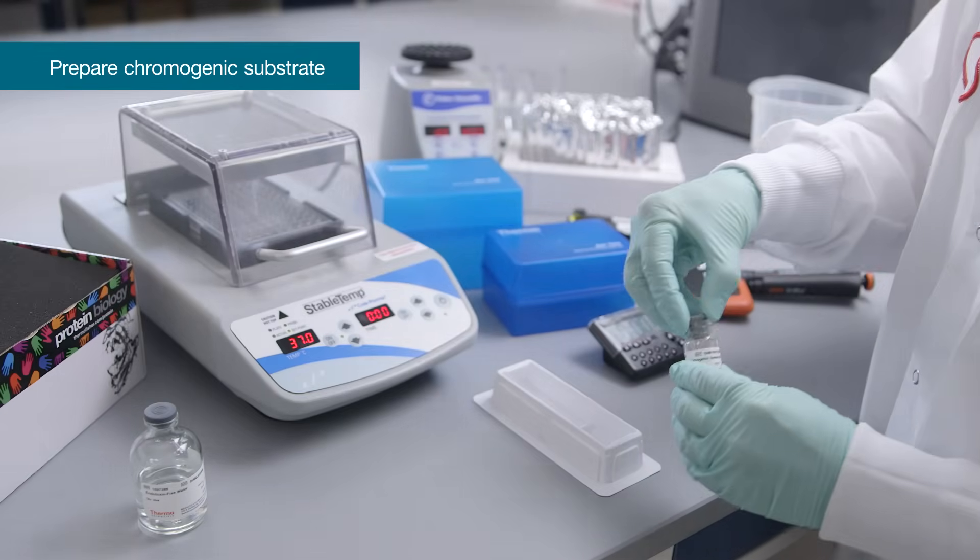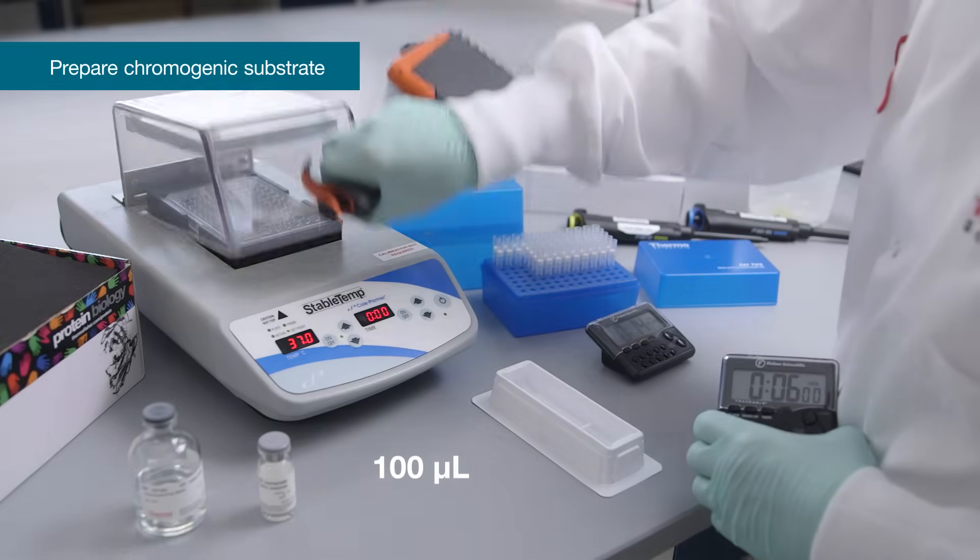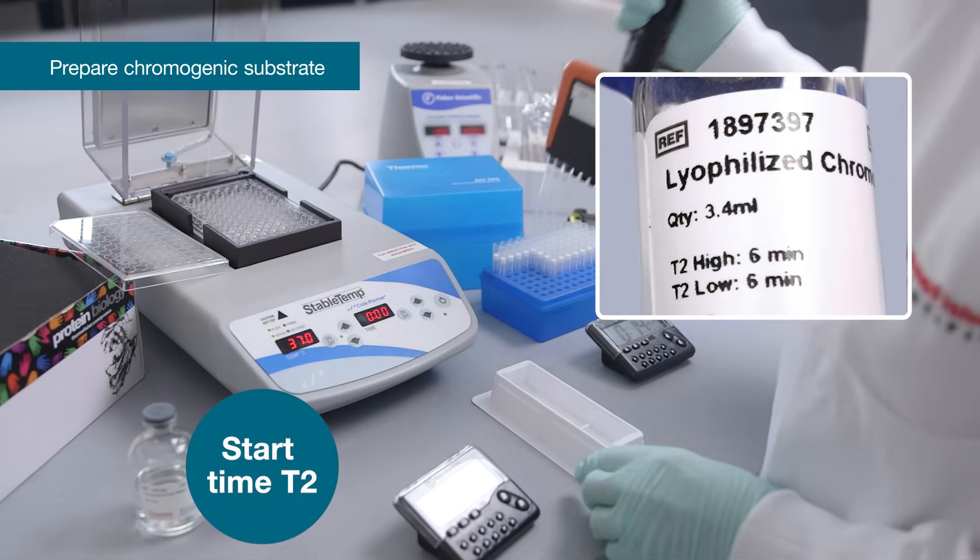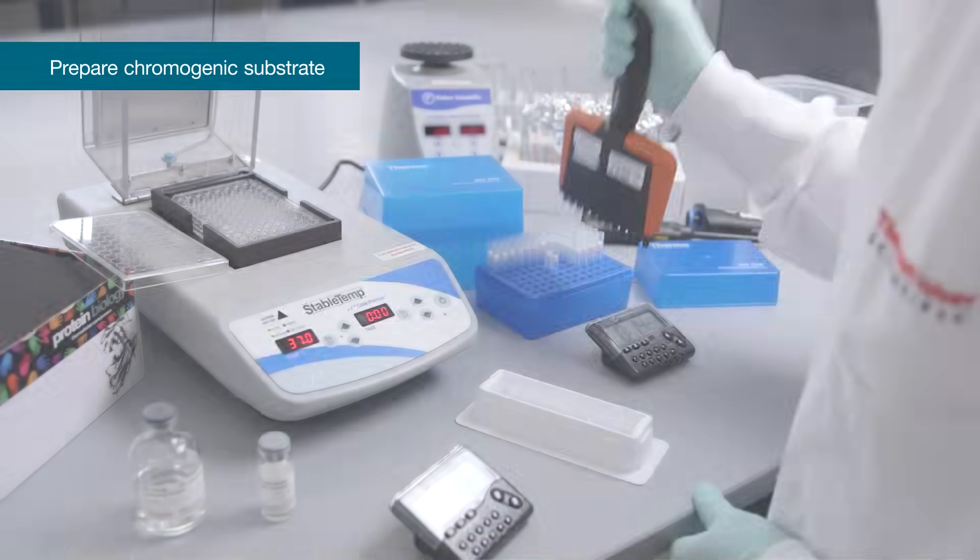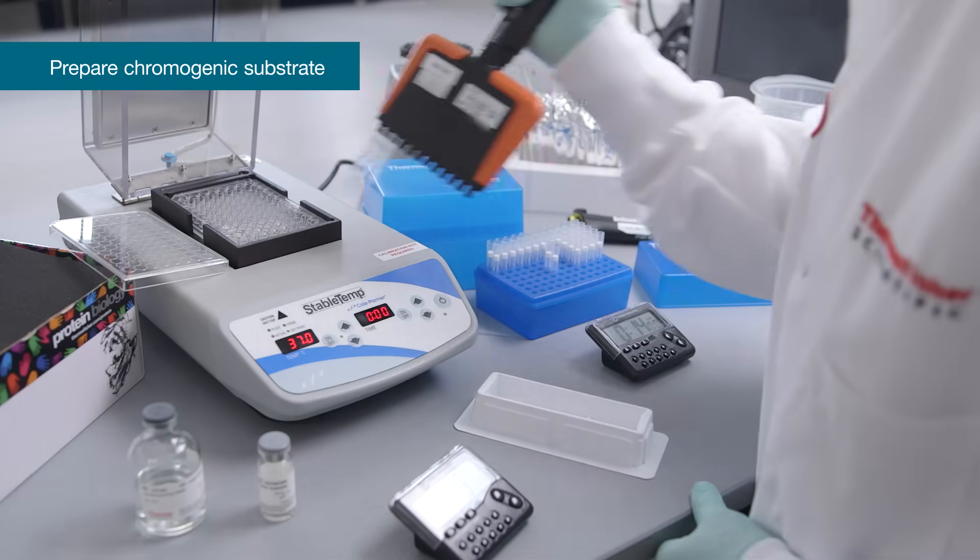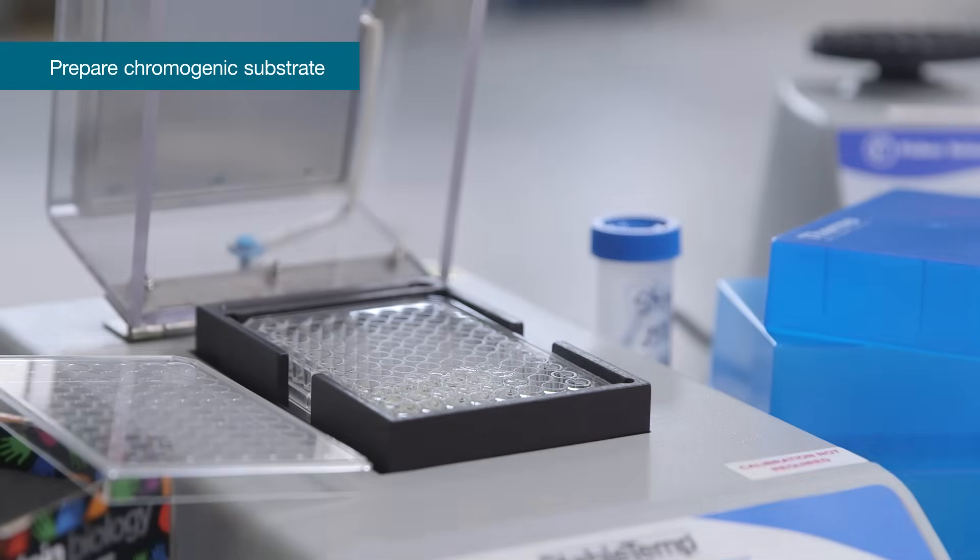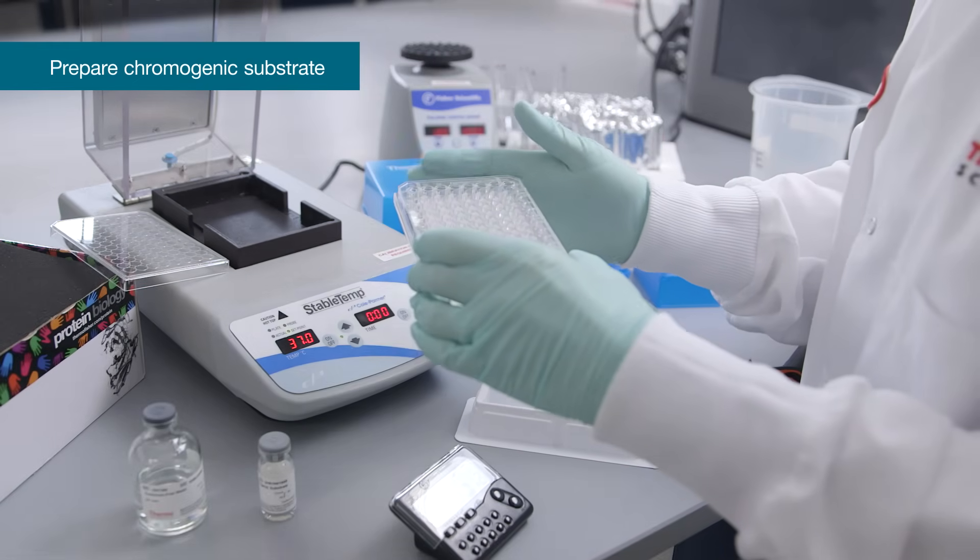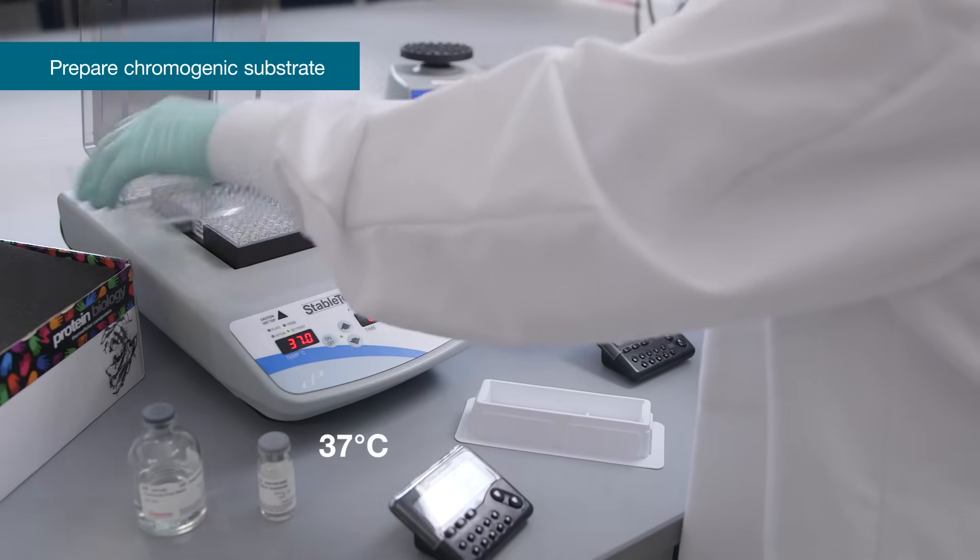When the incubation time with amebocyte lysate is completed, pour reconstituted, warmed chromogenic substrate into the pyrogen-free reservoir and using a multi-channel pipette, add 100 microliters per well. Note, time T2 of 6 minutes starts with the addition of substrate to the first wells. After substrate is added to all wells, briefly remove the plate from the plate heater and gently tap 10 times to facilitate mixing. Return the plate to the plate heater at 37 degrees Celsius for the remaining incubation time.